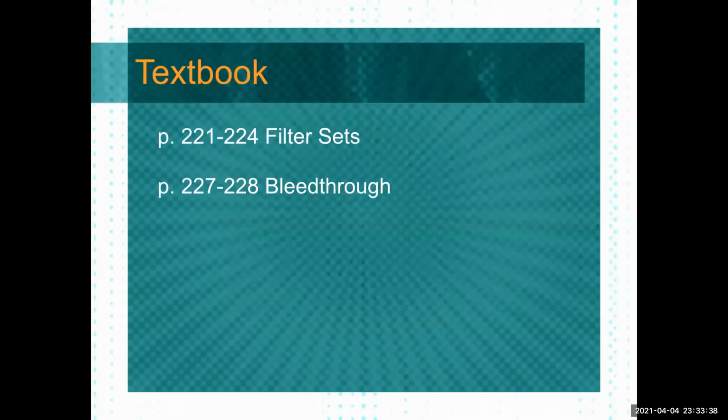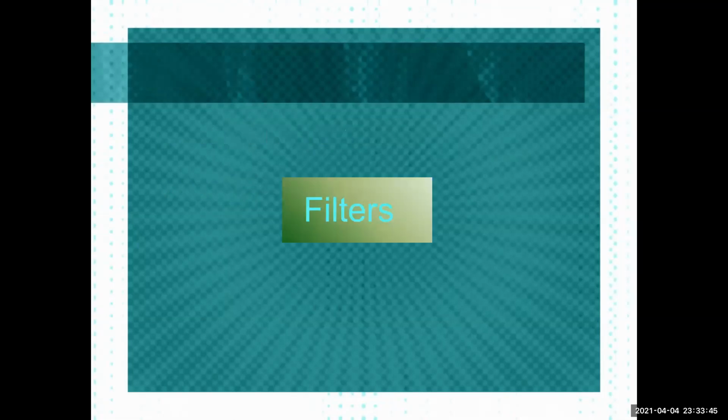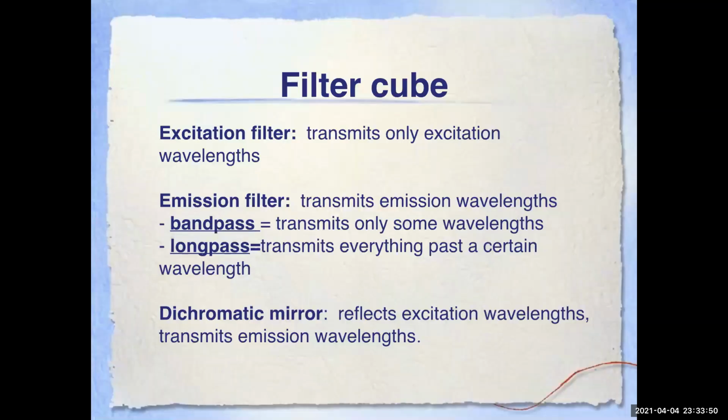If you have the Davidson-Murphy book, these are the pages where this material is explained. And let's talk about filters.